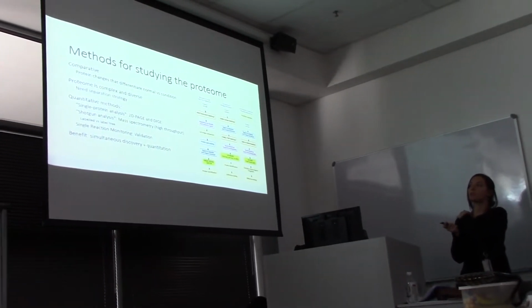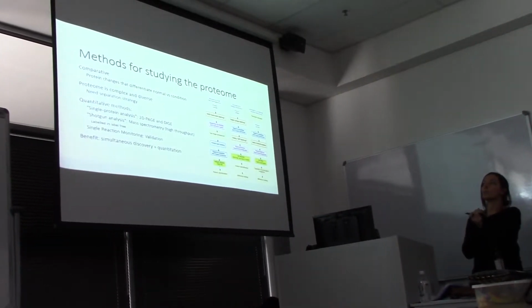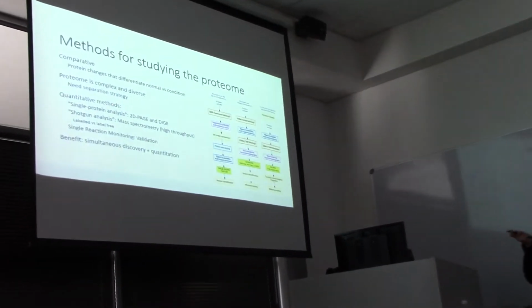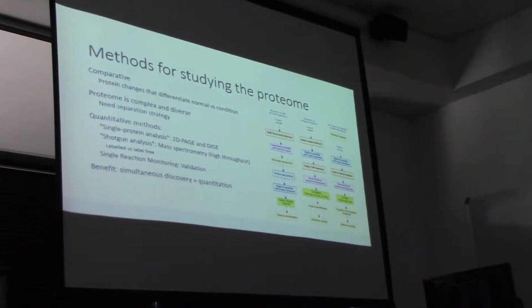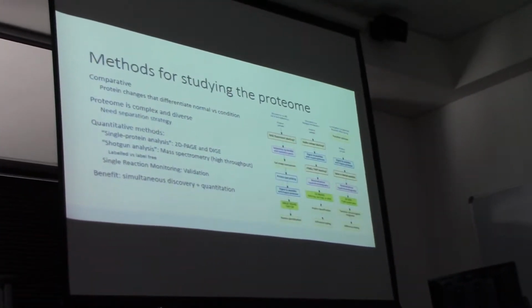So I'm focusing on quantitative methods. You can do what's called single protein analysis on a 2D gel or a DIGE. I think some people are doing 2Ds, right? There was someone who mentioned 2Ds. Well, we'll talk about that.